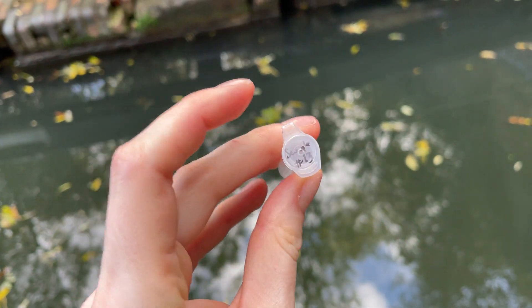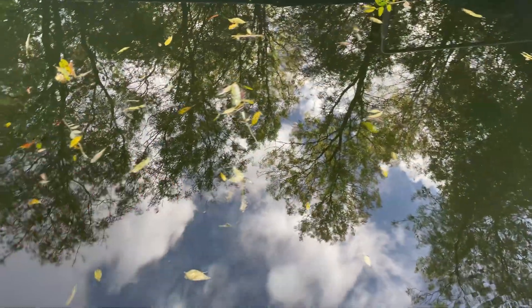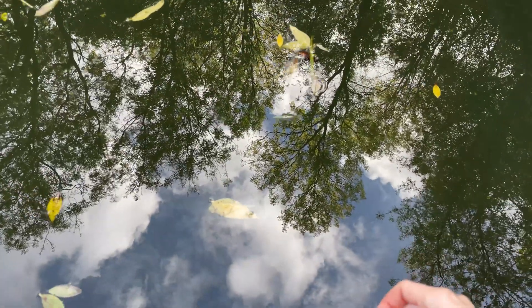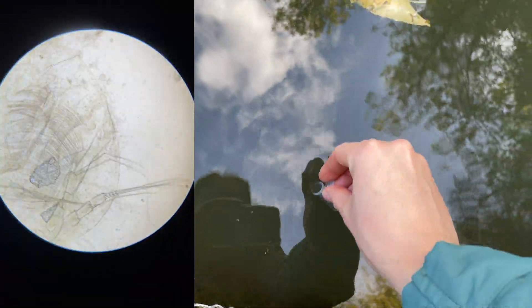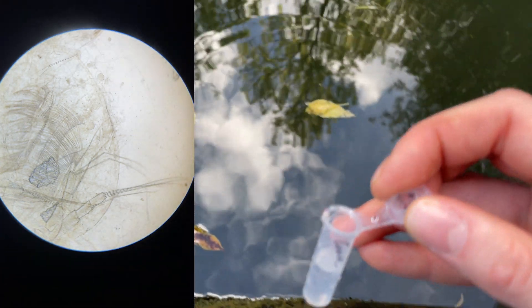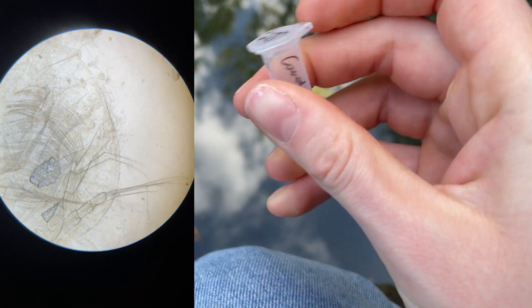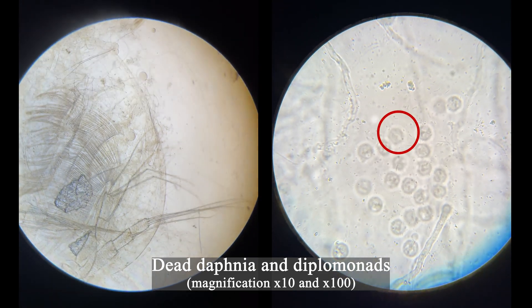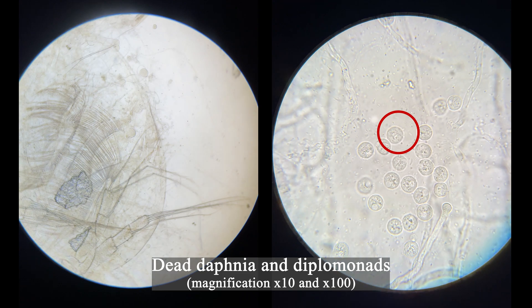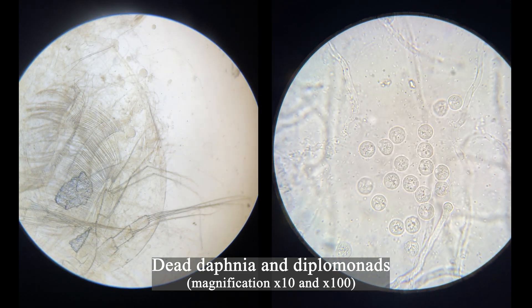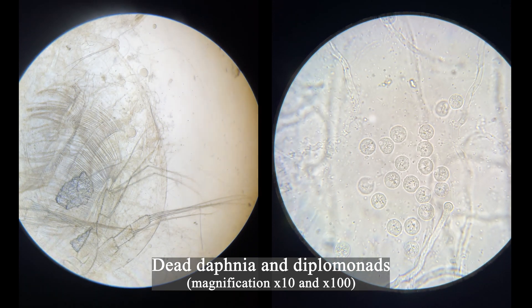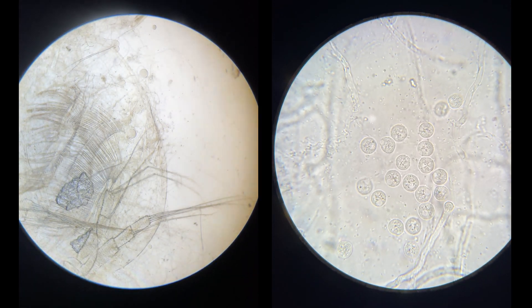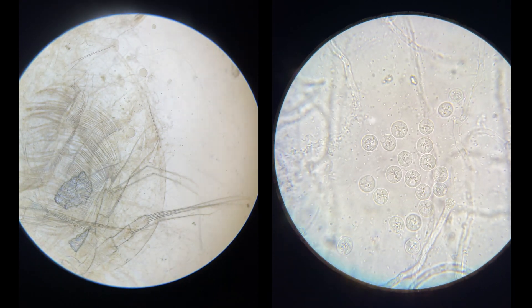The last sample I want to take is from this beautiful Dudley canal. In the canal I caught a corpse of a Daphnia, which was quite weird to find here — Daphnias usually can be found only in clean fresh water, so it was no wonder it was dead in the Dudley canal. All over Daphnia's body you can see a feast of diplomonads. Diplomonads are small protozoan cells that usually have two nuclei and four or eight flagella. The most famous member of this order is Giardia lamblia, the cause of the diarrheal illness giardiasis.